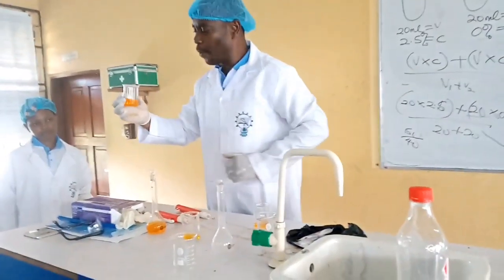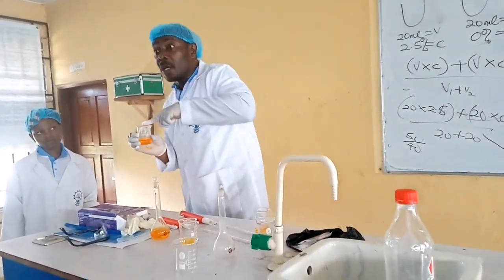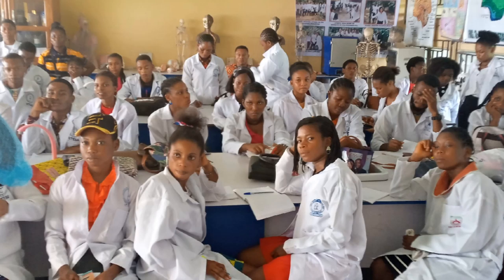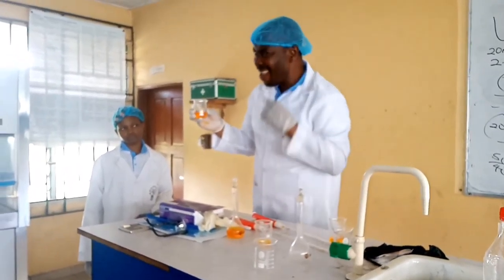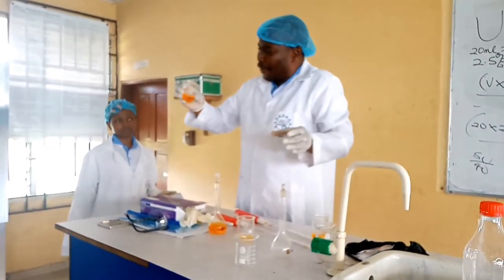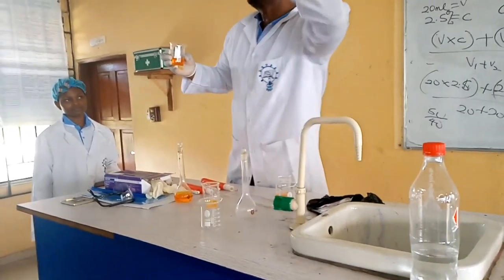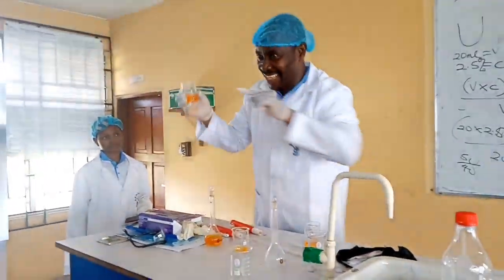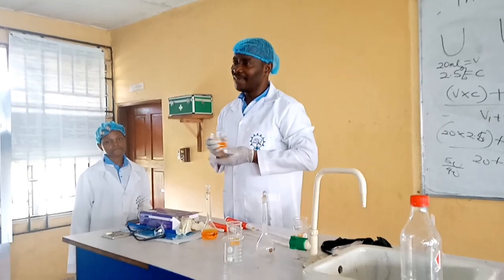Down. Now that we are here, we come and take more from this, and come and take from this and join. You are seeing that the taste will not be sweeter than this one. Can that happen? No. In fact, once you have added water to anything you took from here, there is no way it's going to be sweeter than this one again. Once water enters something, there's nothing you can do unless you want to evaporate. And you can only evaporate until you come back to this one, or you further evaporate. But are you getting the point of it? Yes, sir. Let us now start our practical.